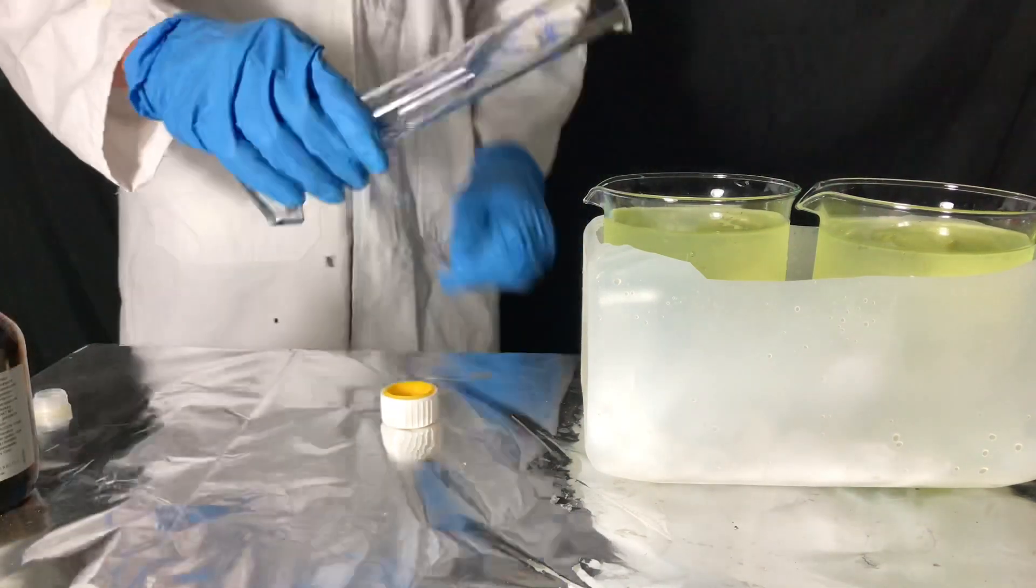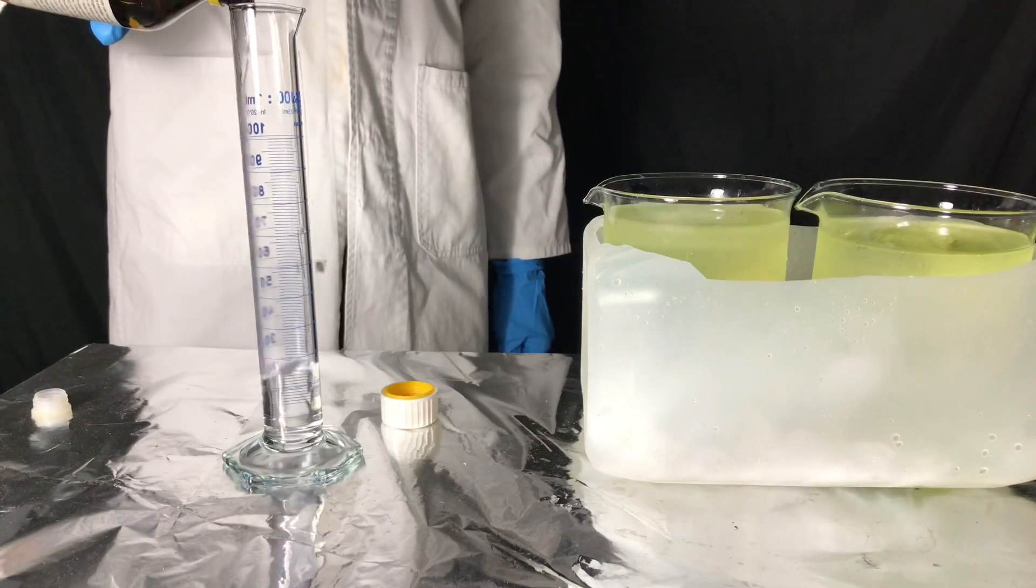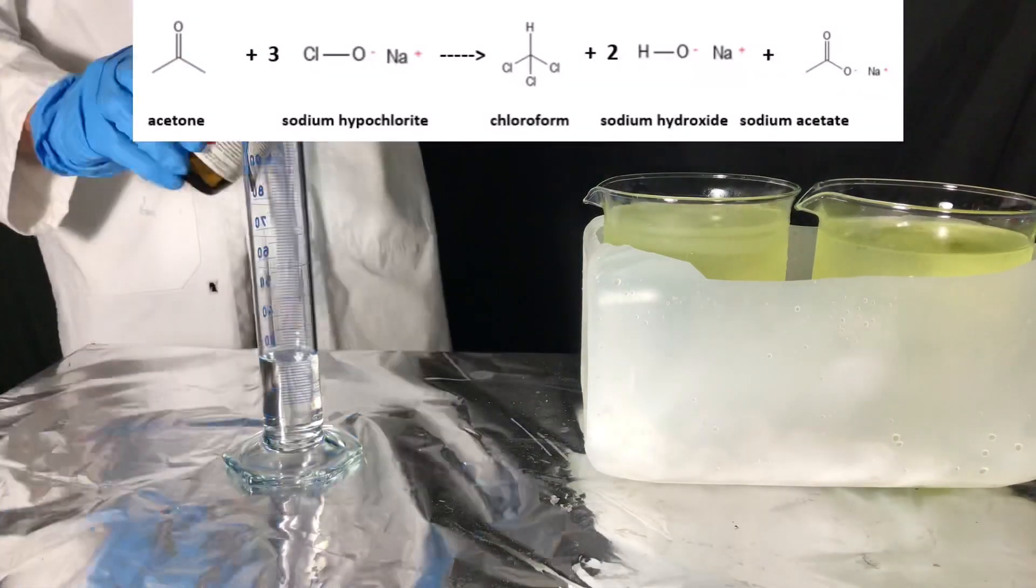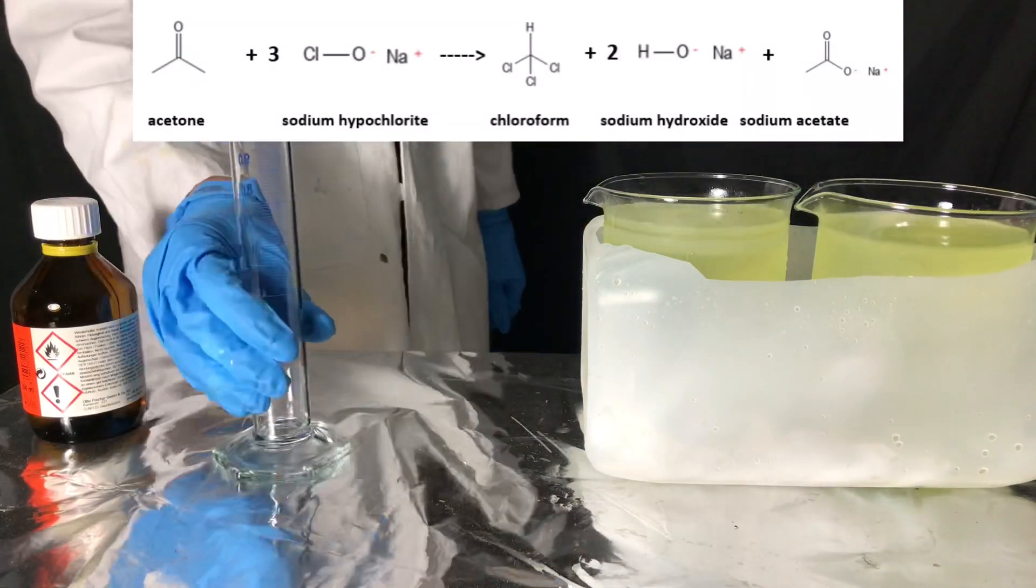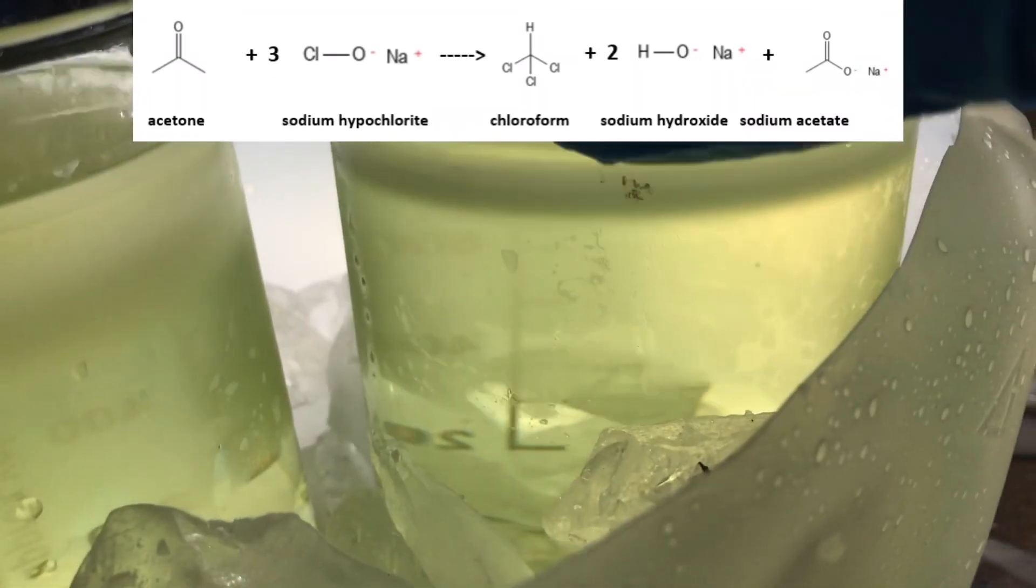The reaction that will occur when sodium hypochlorite reacts with acetone is known as the haloform reaction. In this case with acetone, chloroform, sodium hydroxide, and sodium acetate will be formed.